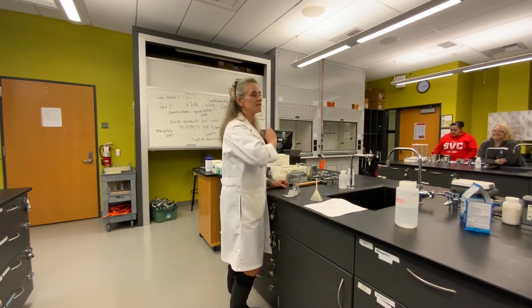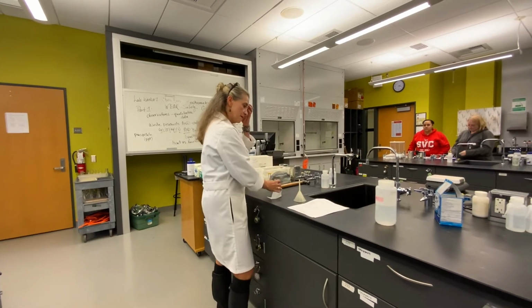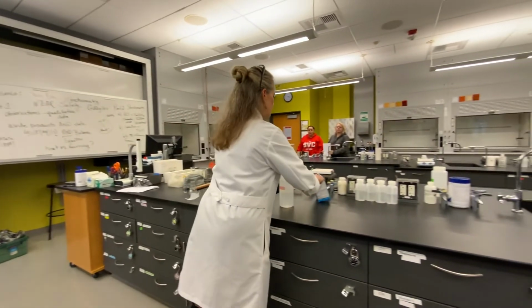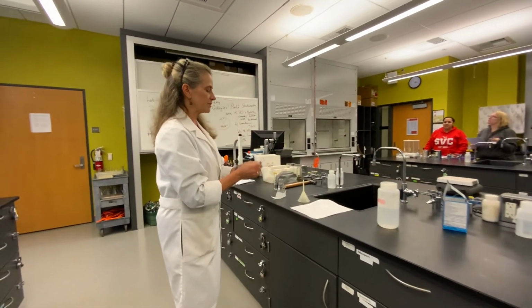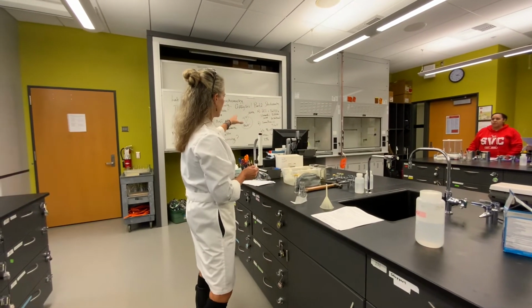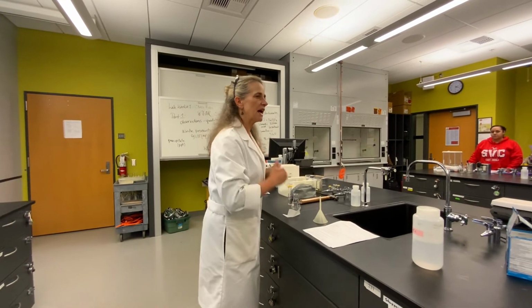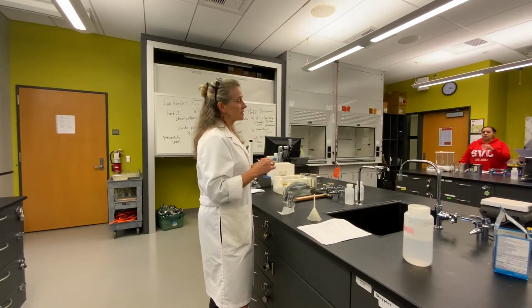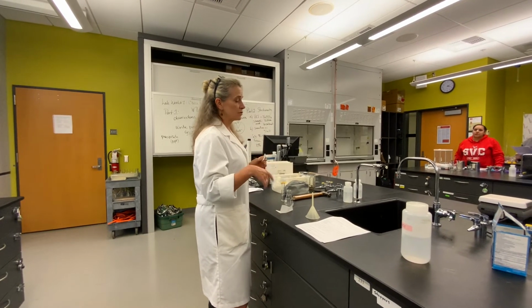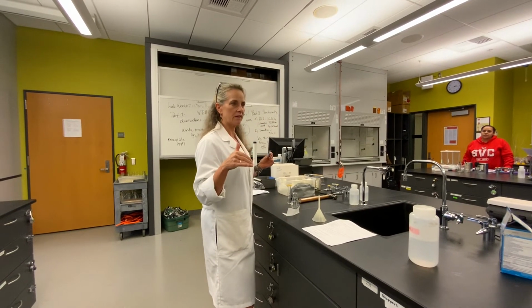Okay, so you're going to do the same thing again. And by the way, this can go down the sink. That's okay. All right? So you're going to do the same thing again, but this time you're going to use an Alka-Seltzer tablet. Okay? So the Alka-Seltzer tablets, like I said, have a whole bunch of stuff in them, but they have a little bit of sodium hydroxide. So the exact same reaction, not hydroxide, sodium bicarbonate. They have the exact chemical reaction happening. But there's other stuff in the way, and we could think of them as spectators. They're not really doing anything, okay?